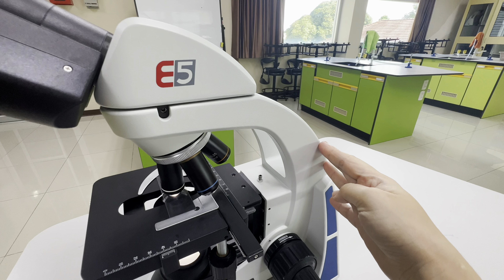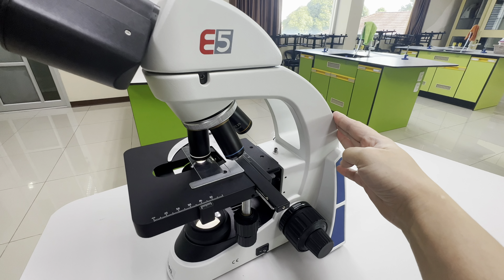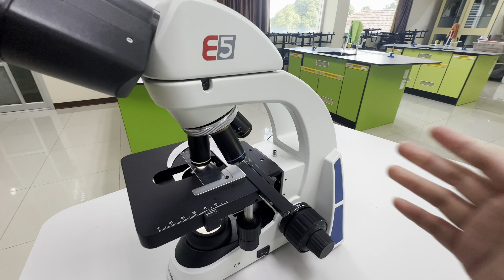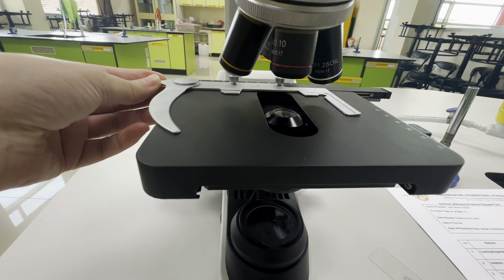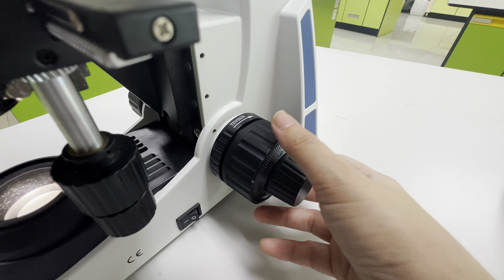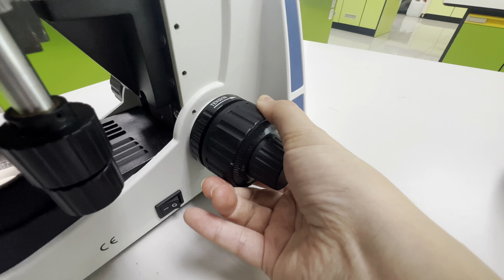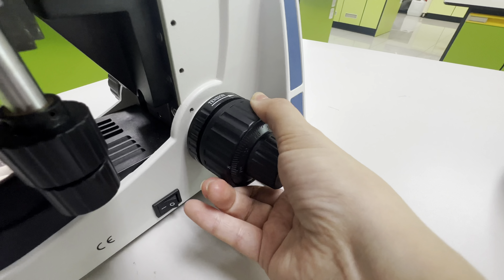This part is the arm. It supports the ocular lenses and connects it to the base. It is also used to carry the microscope. This is the stage and the stage clip. The stage is the platform where you place the slide specimen. The stage clip holds the slides in place.